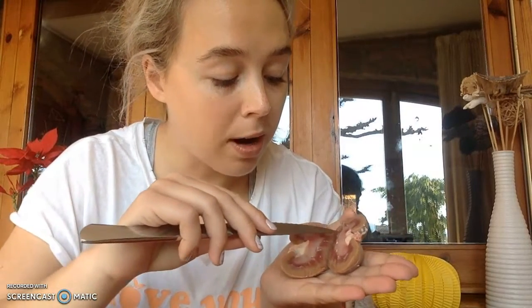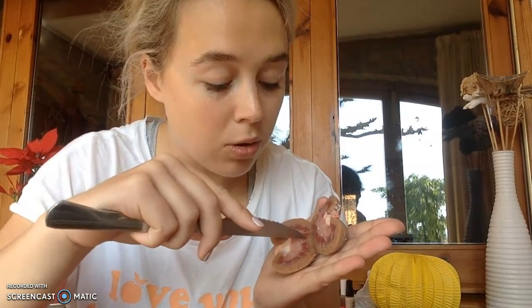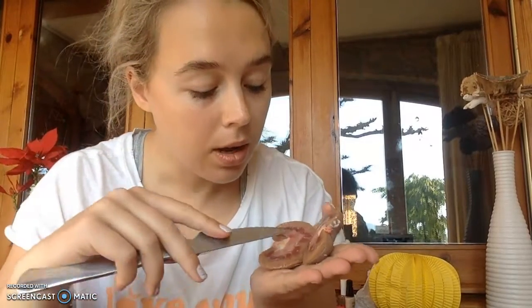In between the renal pyramids is this area right through here. Again, I'm tracing it with the tip of my knife. Those are our renal columns. It's made up of this kind of connective cortex tissue, but the renal columns is what connects or contains the interlobar veins and arteries, which again help with the filtration process and filtration system.